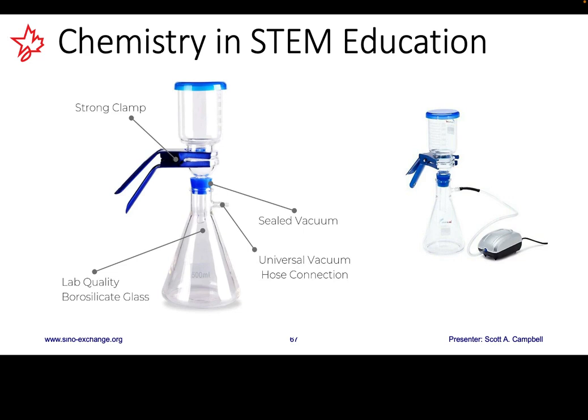You can now dispose of the initial acid solution. Please note that there will be dissolved metals such as iron, lead, and copper in this solution, which could be recovered using more advanced recovery techniques. However, these methods are much more complex and require the use of many more chemicals. Moreover, as gold is the most valuable metal and time is limited, it's practical to only focus on extracting gold in an educational setting.